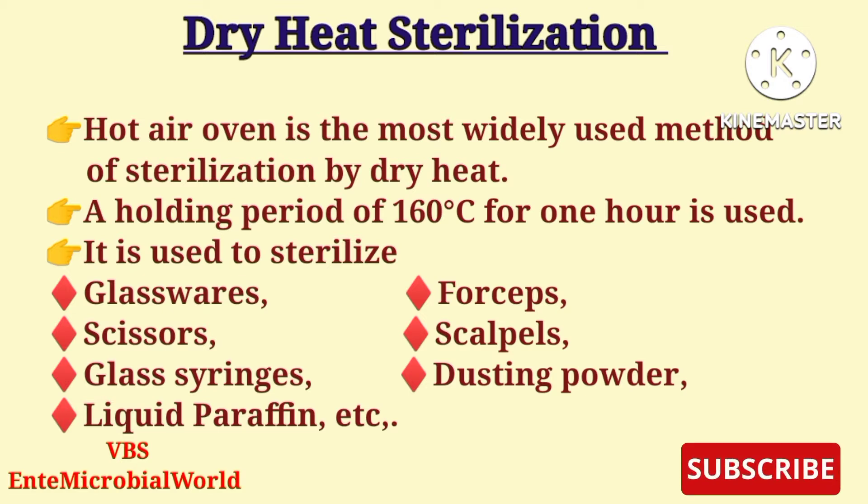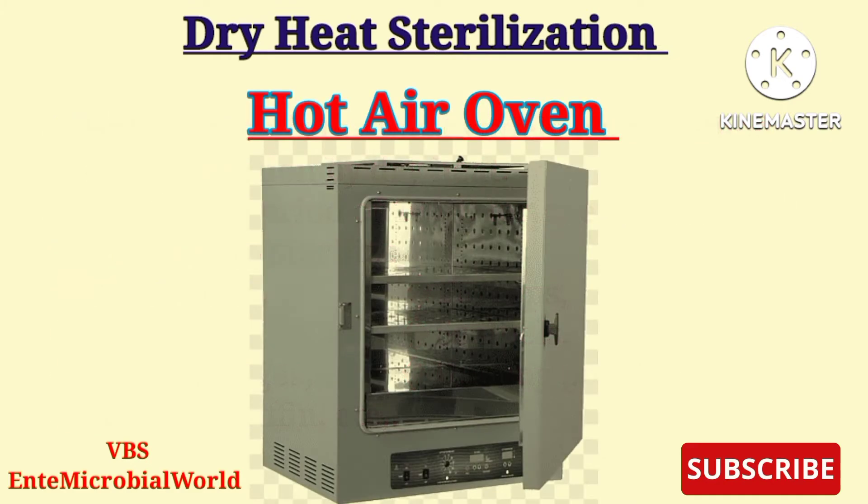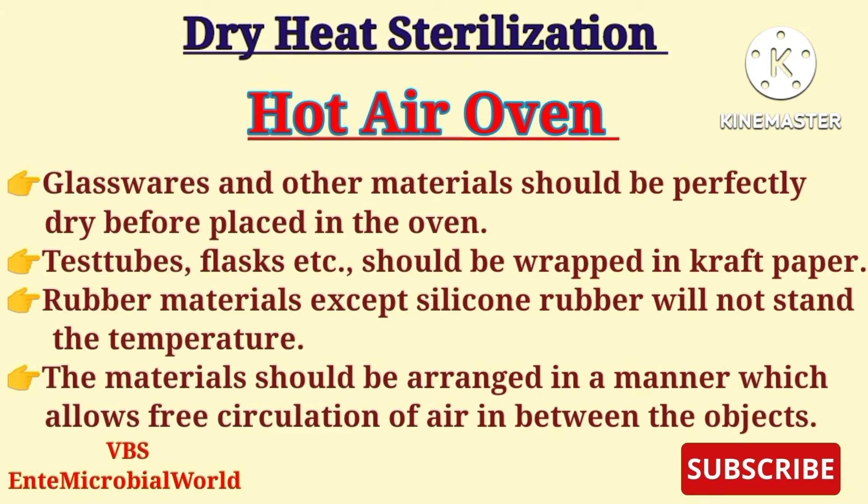Here are some important points about the hot air oven. Glassware and other materials should be perfectly dry before being placed in the oven. Test tubes, flasks, etc. should be wrapped in craft paper. Rubber materials, except silicone rubber, will not withstand the temperature.